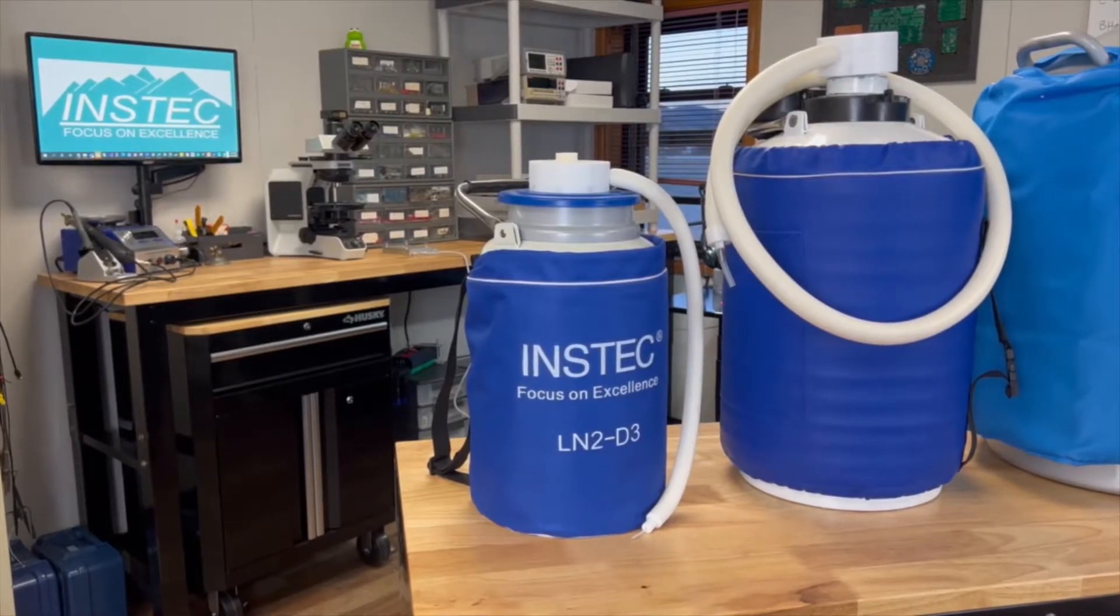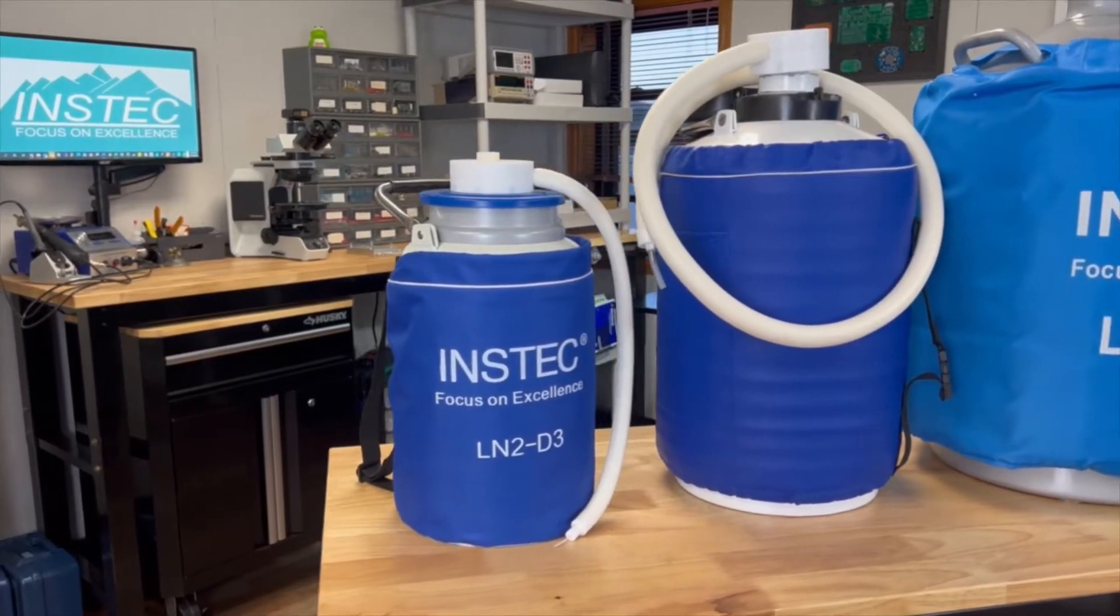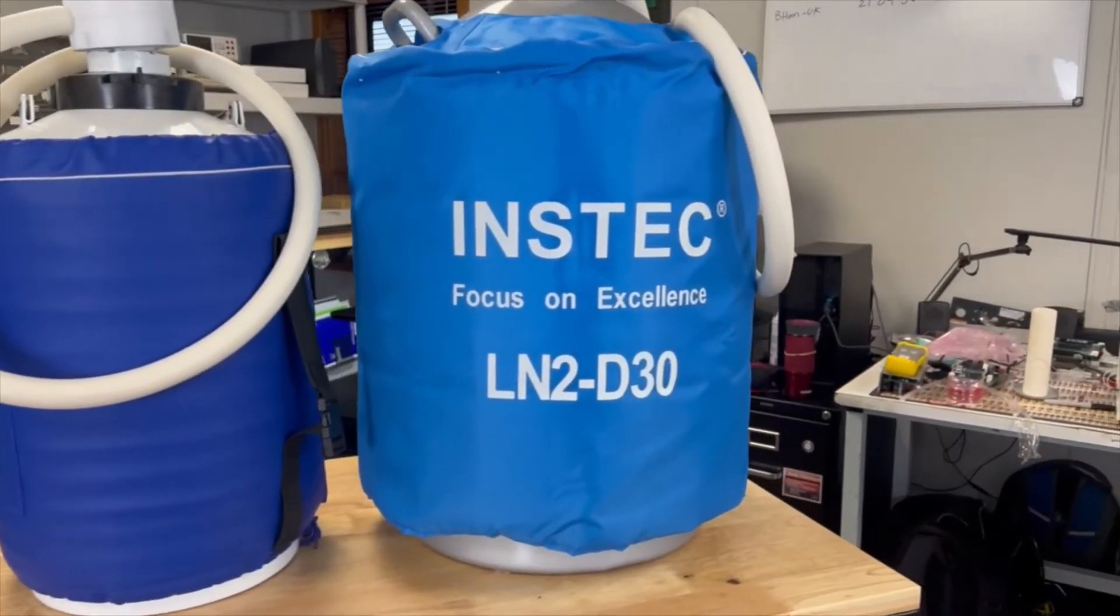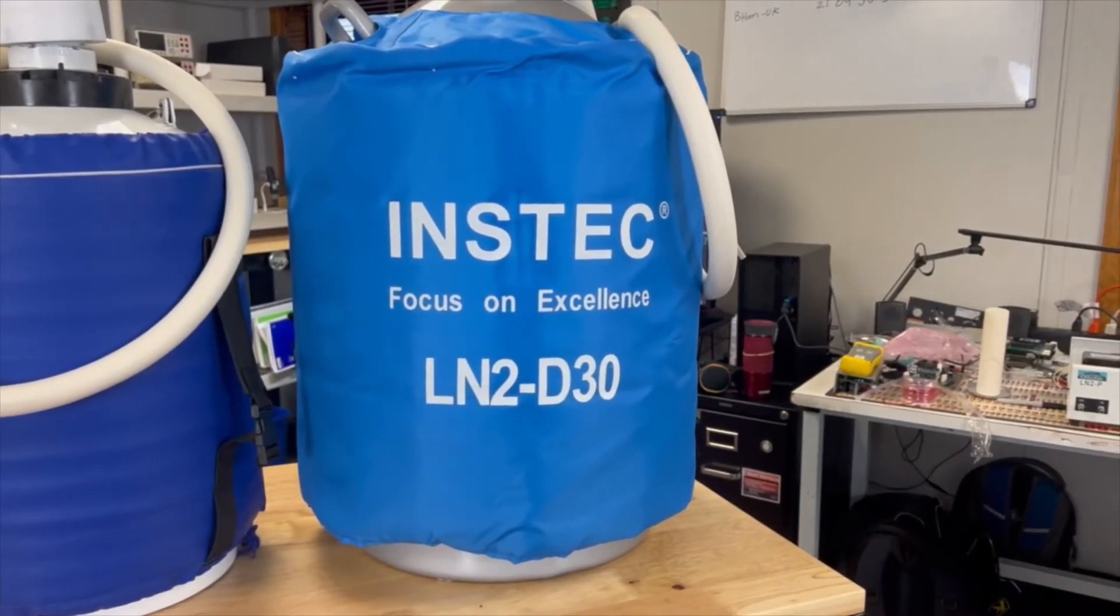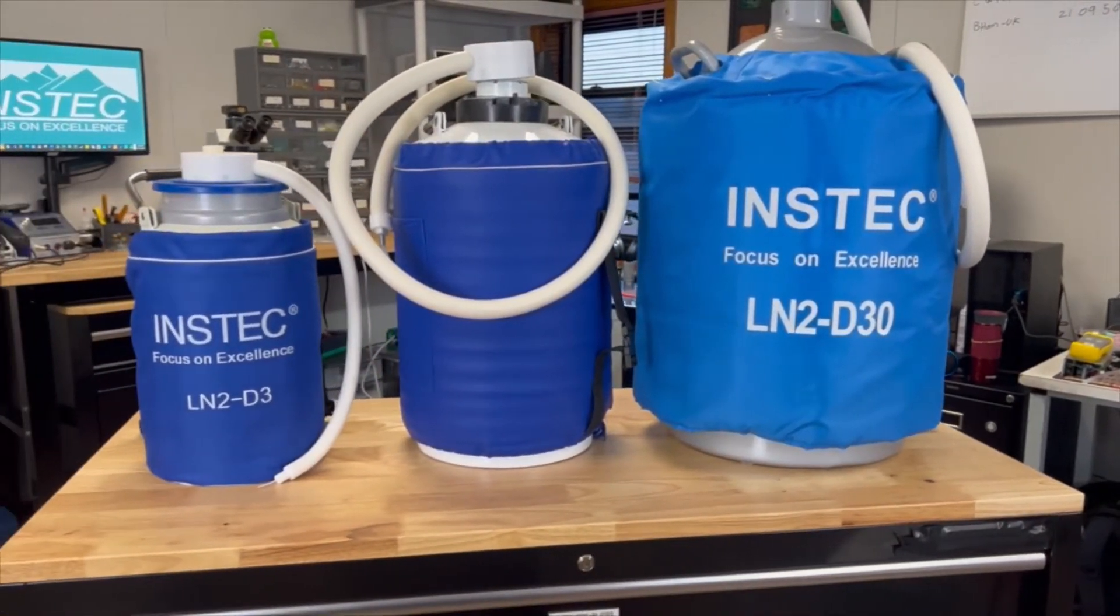To introduce our INSTEC liquid nitrogen system components we first have the Dewar. The INSTEC LN2 Dewar is an insulated container which connects to the thermal stage. INSTEC offers Dewars in three convenient sizes including 3 liters, 10 liters, and 30 liters depending on your experimental duration and thermal load.